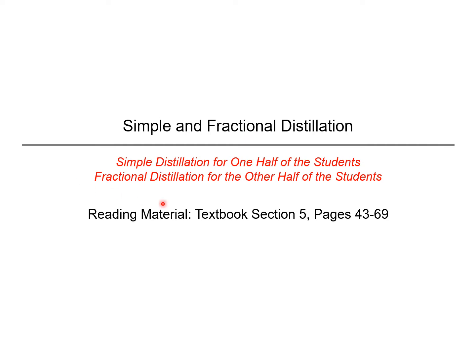If the experiment were to be conducted in class, half of the students would perform simple distillation and the other half fractional distillation. Again, as always, please read the textbook. It's always very useful to get all the information you need in case something isn't covered in the lecture.